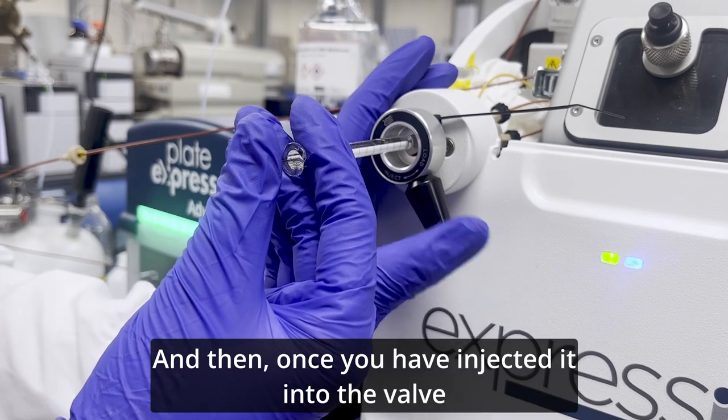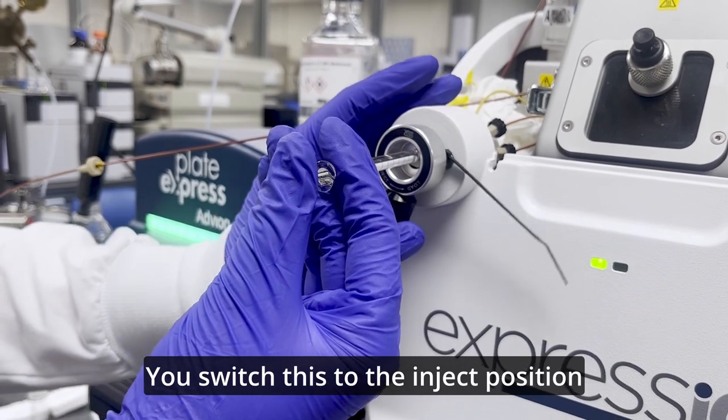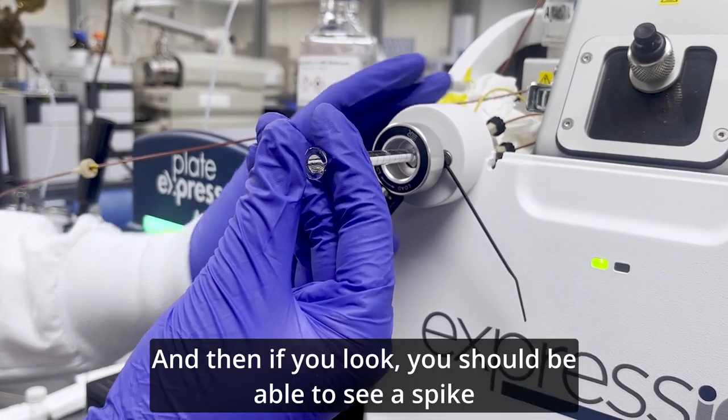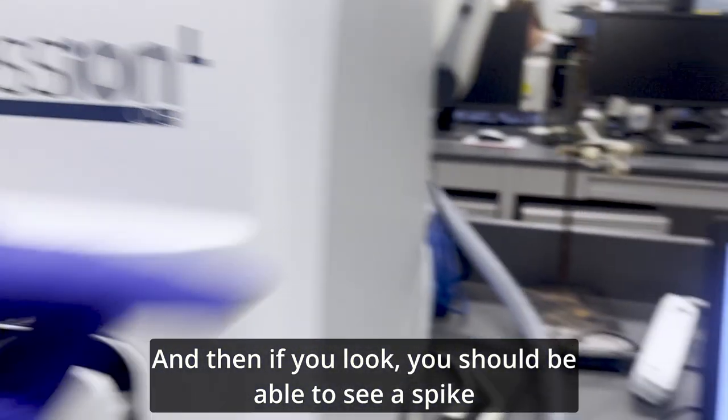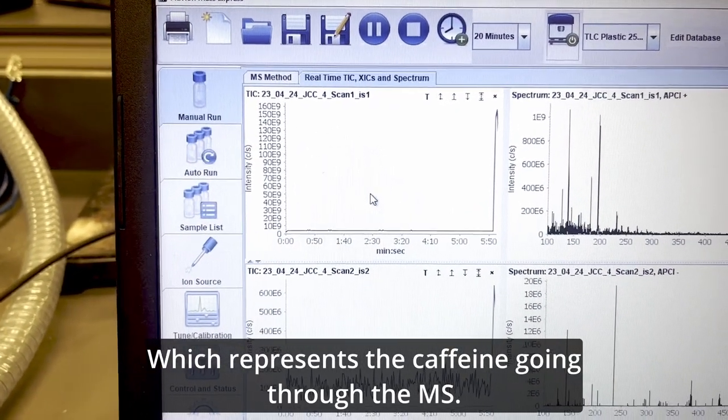And then once you have injected it into the valve, you switch this to the inject position. And then if you look, you should be able to see a spike, which represents the caffeine going through the MS.